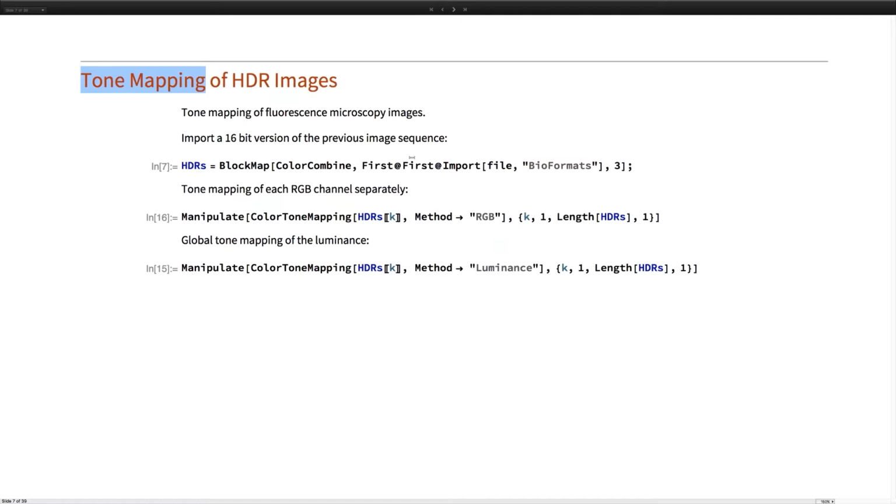So your eye has the capability to adjust to lots of light intensities, and that allows us to also see details in the dark or details in the very shiny parts of our everyday life, but not necessarily in images. So what I do here is I now take the first block or the first sequence of data from the file I was just about to import. There we saw it has a 12-bit encoding. So what I do now is encode the whole data set. It would essentially be a 16-bit encoding because it's the next bigger encoding scheme in Mathematica or the Wolfram Language.